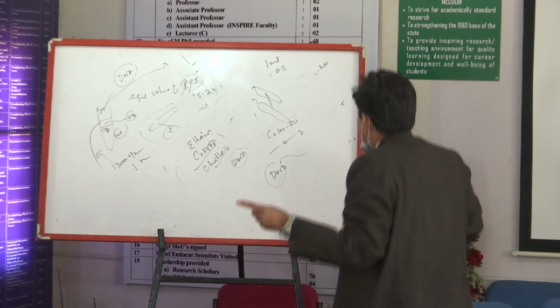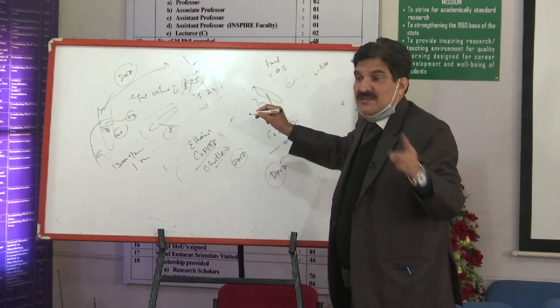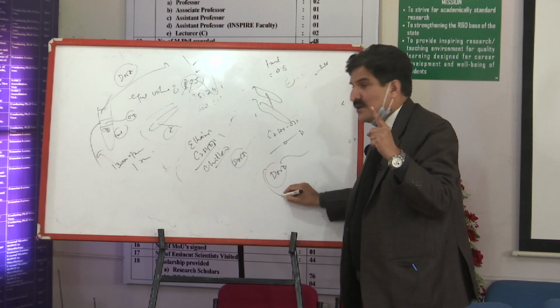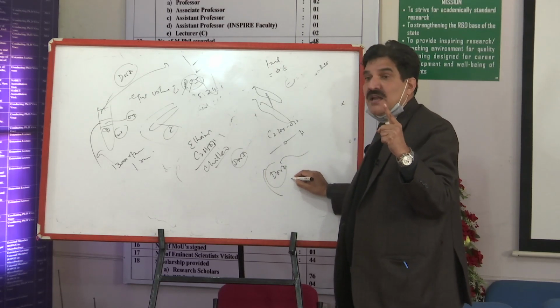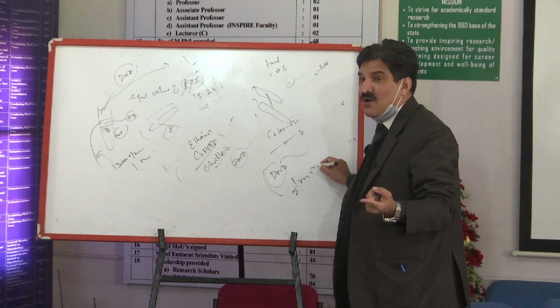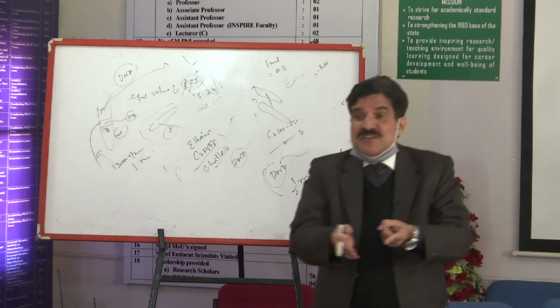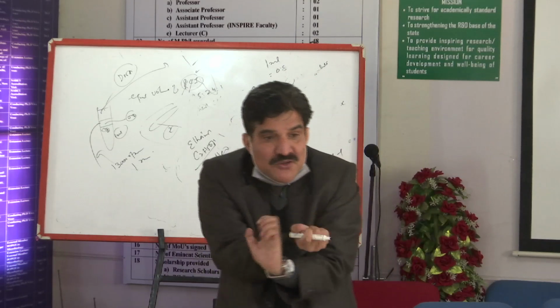Second thing, for repulsion, you are removing negative charge, so no repulsion. Another force is added. They are coming more together. And third thing, you are using very, very low temperature alcohol. Temperature is creating 1/2 mv square, if you know, if not, 3/2 RT. Because temperature is decreased, motion of molecule is decreasing. When motion of molecule is decreasing, they are coming close to each other, and collapsing is again added.